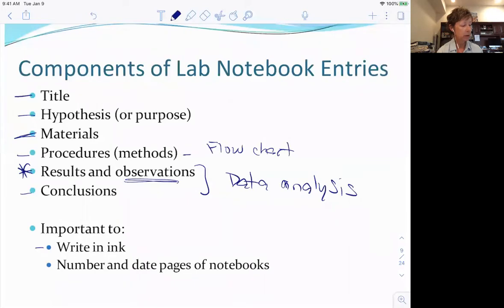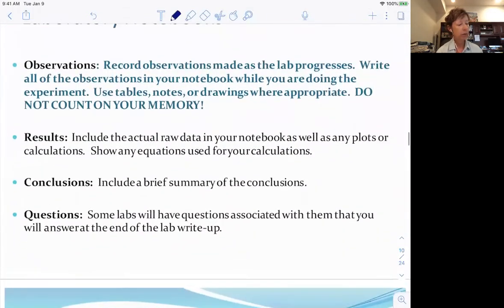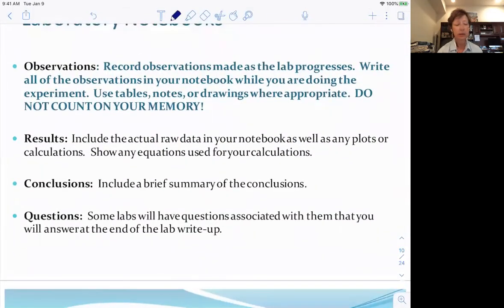In your lab notebook, you would write in ink, and you would number and date the pages. There's a write-up in the textbook about the discovery of Claritin and the importance of dating and initialing to show that you did that work. That sets a legal precedent, and that's the basis for a lot of patents. In a research notebook, it's a really critical step to acknowledge that you did that work and dated it, and you set precedents for things down the road. So it's really important that you record during the lab.